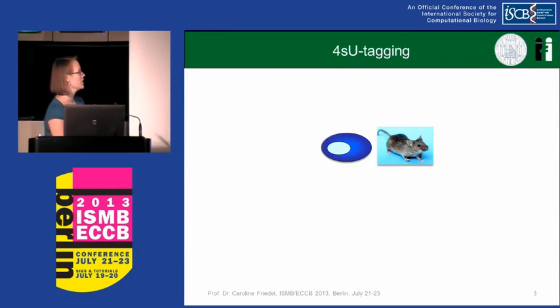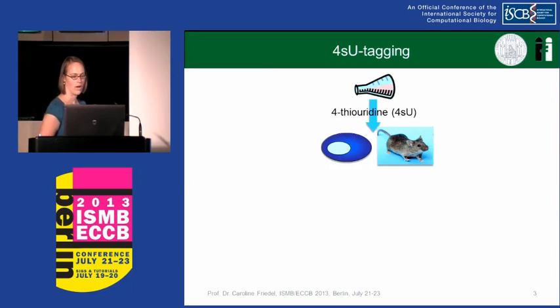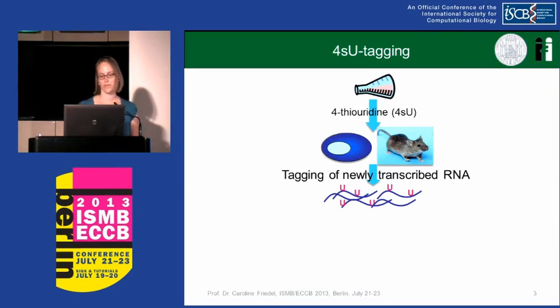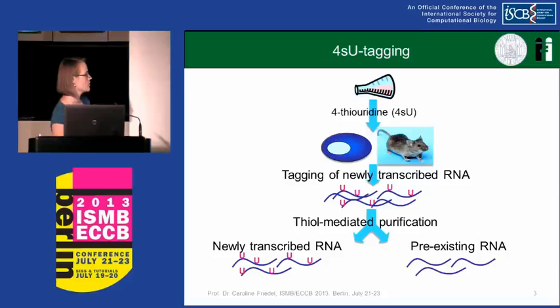The method we use, 4sU-seq, first applies a method called 4sU-tagging for labeling newly transcribed RNA. The way it works, in short, is that you use 4-thiouridine, which can be applied to cell cultures or also in vivo. The uracils which are incorporated during de novo transcription have a thiol group attached to them, which can be used to purify the newly transcribed RNA and to separate it from the pre-existing RNA which is left over from the beginning of labeling.